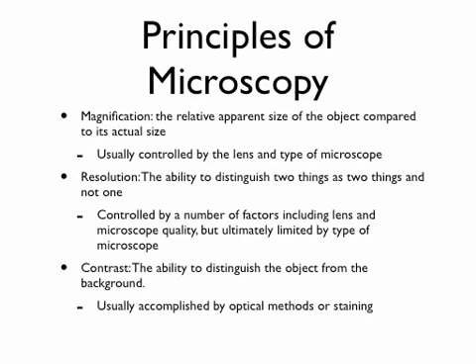I see that it's a weird shaped dot, but I can't tell if it's 1 object or 2 objects from this distance. You get closer, and you go, oh yeah, that's definitely 2 dots. I can see that. So that's resolution. The ability to distinguish that 2 separate things are separate things and not the same thing.